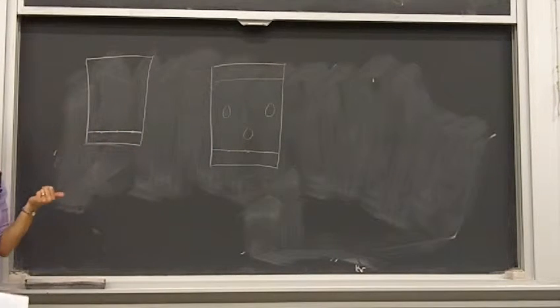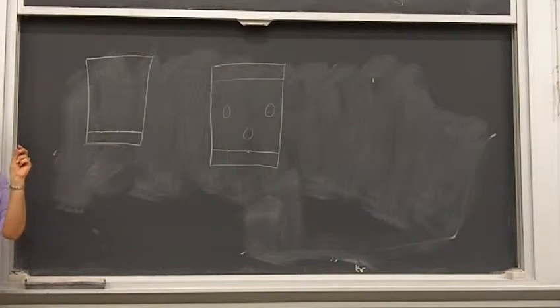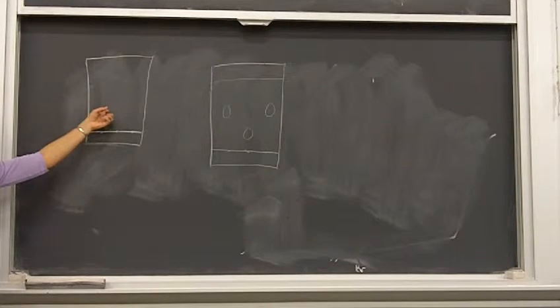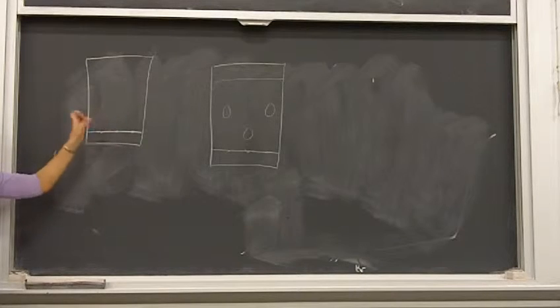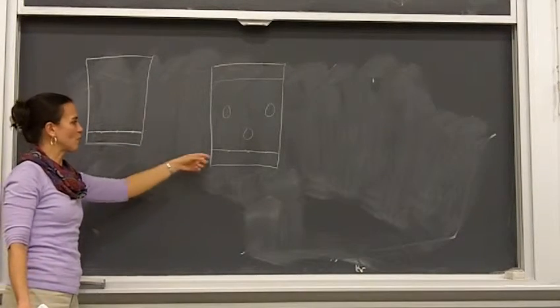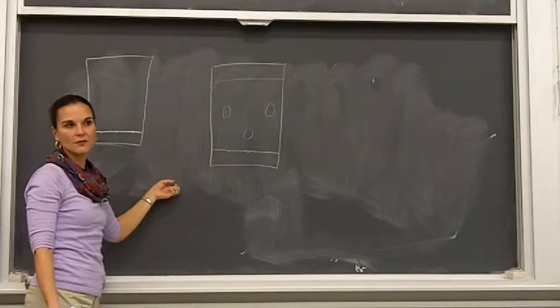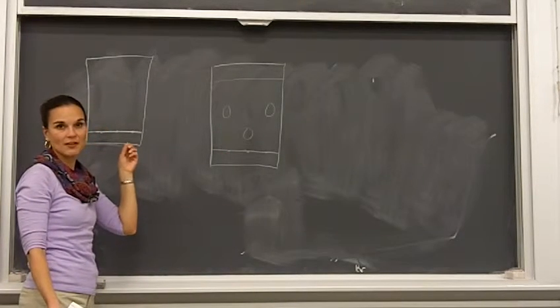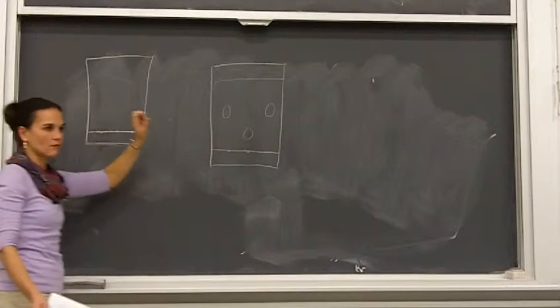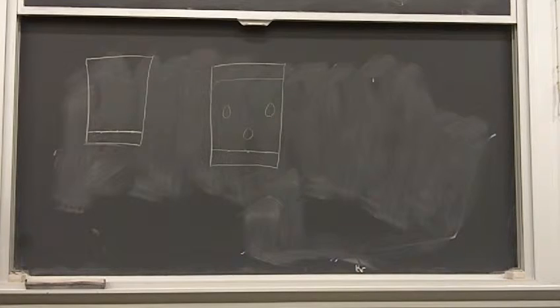The reason you always use pencil with TLC plates is because ink pen has chromophores in it. It has lots of aromatic compounds in it, and so it will mess up what you see on the TLC plate if you use ink pen. You have to use pencil on TLC plates, okay? And the other thing is pencil wants to etch the silica off, so you have to be careful. Don't use the sharpest pencil. You kind of actually want it to be a little bit dull so you can circle things on it without etching away your silica. The other thing is your hands have lots of chromophores in them.